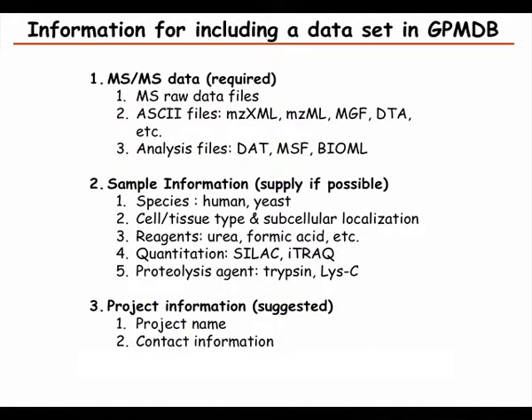Here, the choice that GPMDB made was that there's only very little information required. It should really be simple to submit data.